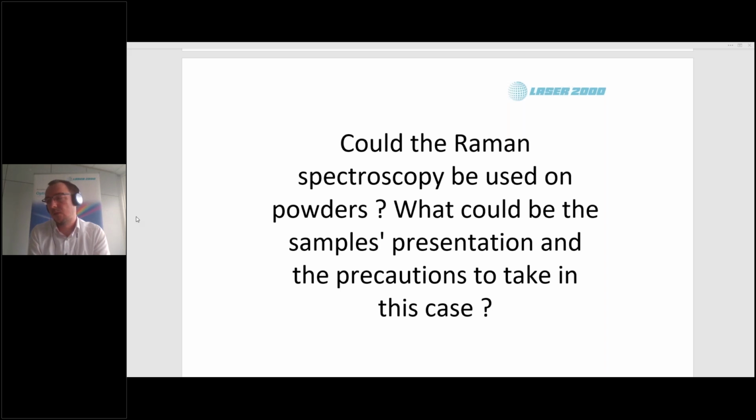So when using a handheld device or a probe, always, unless you have a certified laser safety concept or a sample holder with an internal trigger that only triggers the laser when the lid is fully closed, make sure that you have proper protection to keep your eyes and your skin and your surroundings safe.